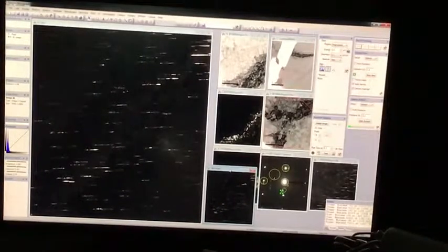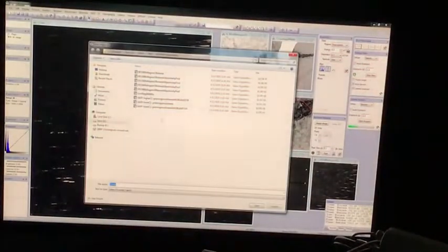And I just actually, before I started recording again, captured an image. So there you go. Look at those precipitates showing up really nicely in both of those images, that one as well, but possibly even more so in this one. So I'm going to save that as, I'm going to save this again, save, and then this one gets saved as position 5.